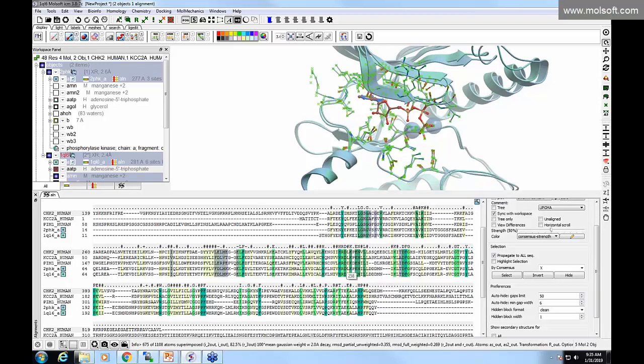So I was showing some annotation. You can box this region and color or whatever you want to do. But for this example, I just wanted to show that we can easily see the conservation in the pocket. At the moment, the pocket, we have this region here. We have a big gap, and another region here that's in the pocket, and a big gap, and another region here that's in the pocket. So we can hide all the regions that are not inside the pocket relatively easily.